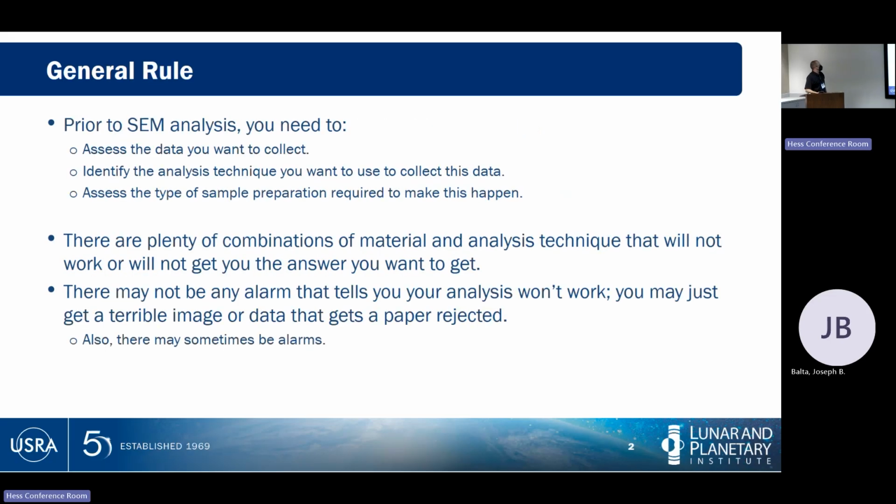Okay, so prior to SEM analysis, you have to do some version of a step to assess what it is you want to analyze, because there are plenty of combinations of materials and analysis techniques that will either not get you an answer or will actually potentially damage your system, which is particularly bad.